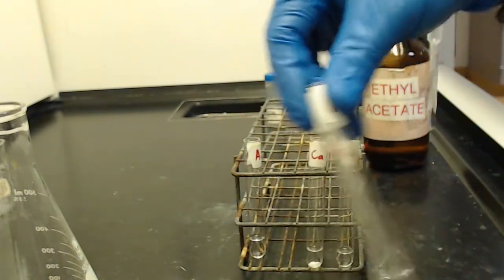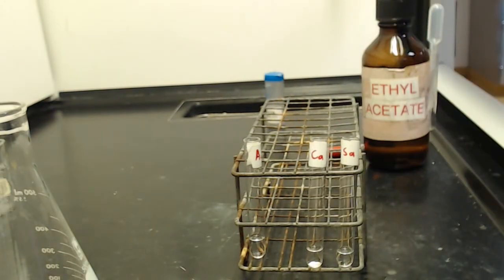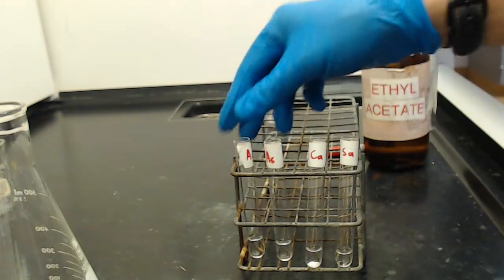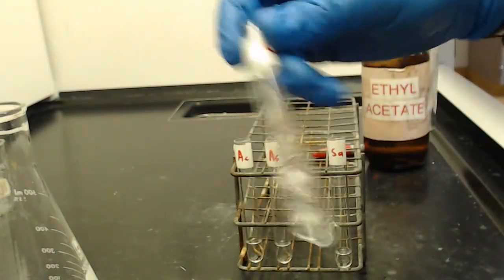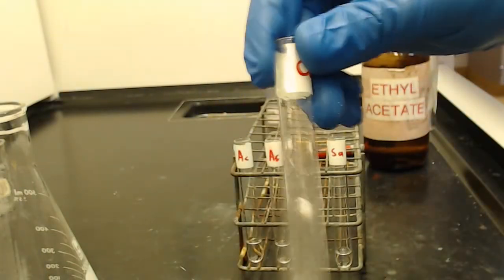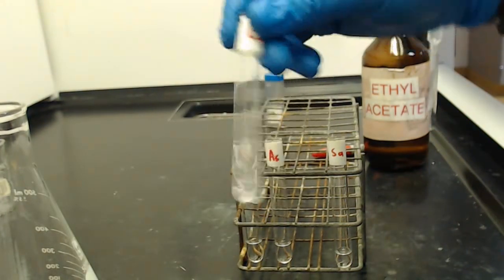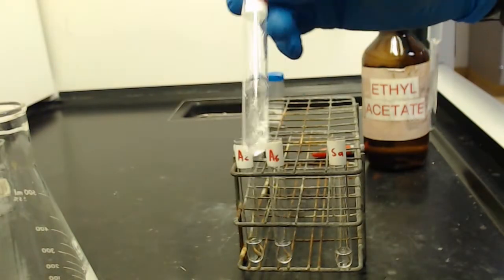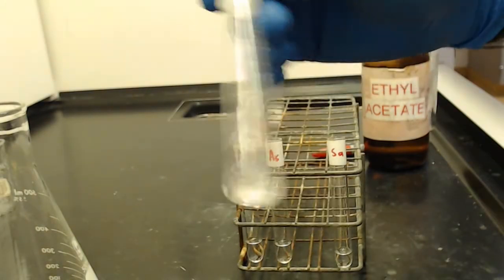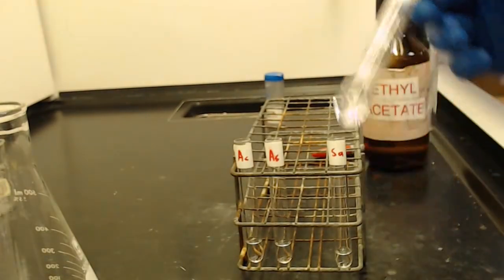Some people like to stopper these with their thumb and then shake them really well, but that almost guarantees you get stuff on your hand, at least when I do it that way. So let's give them a good shake this way. If it's not dissolving well, you could take a spatula and mix it up, or you could take another pipette and use the pipette to mix it up. It's not fully dissolving, but I'm thinking we have enough in solution to get a good analysis by TLC.